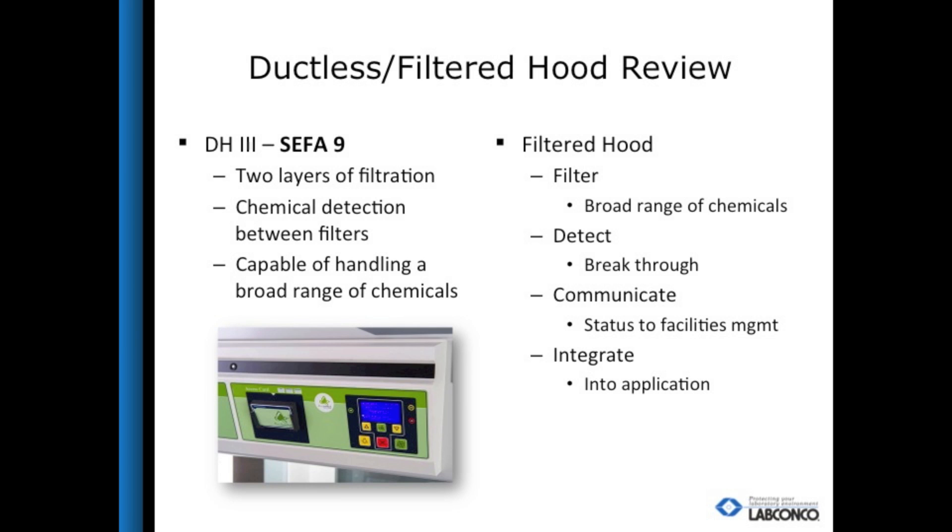A DH3 must have a secondary filter made of the same media and efficiency as the primary filter, and a sensor in between to ensure that if there is chemical breakthrough, the secondary filter can pick it up. To safely replace a ducted hood, a filtered fume hood must be designed for multiple users and usages. To do that it must filter, detect, communicate, and integrate. The filter must protect against a broad range of chemicals commonly found in research labs, such as solvents, acids, and bases. The hood should have a suite of sensors to detect when primary filtration stops. The status of the hood should be known locally and remotely by users and EH&S, along with the history of use and conditions. The hood must also integrate into the lab with the required application.